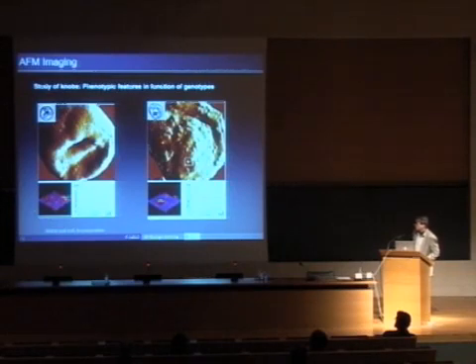And you can see here that these structures are really different. And here is the height in nanometers. So using these techniques, we were able, studying different mutants, to make a link between phenotypes and genotypes. But I won't enter into the detail of this story.